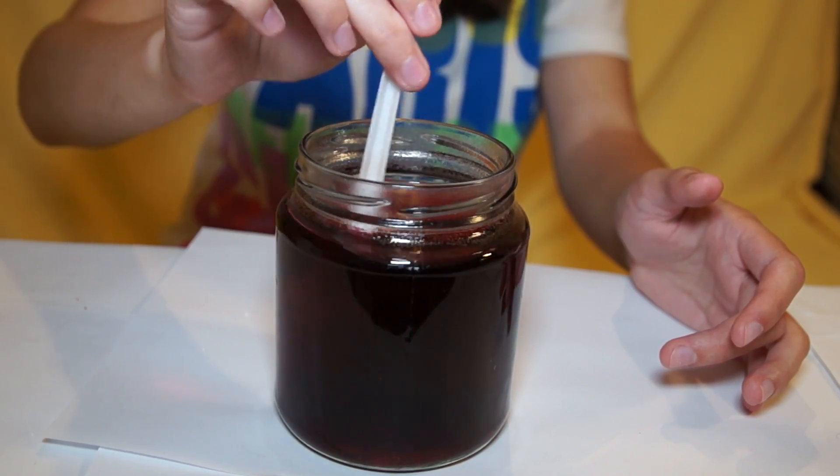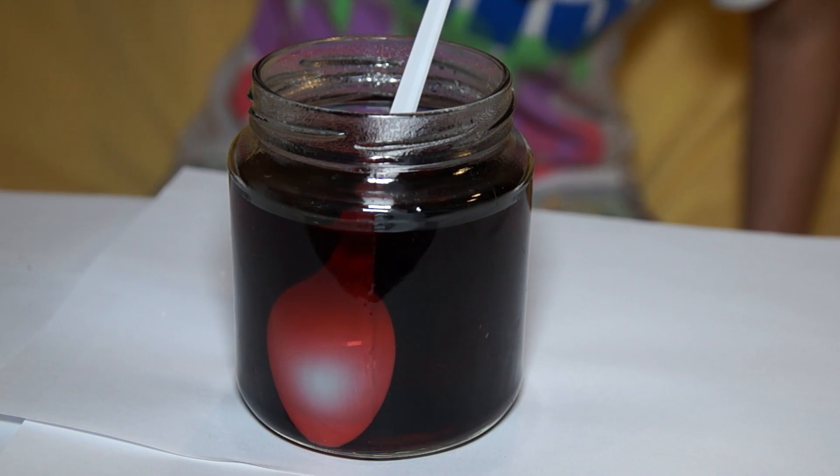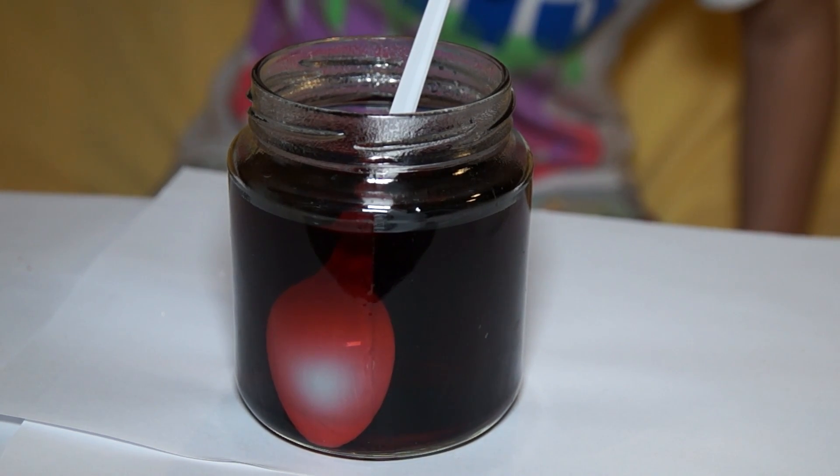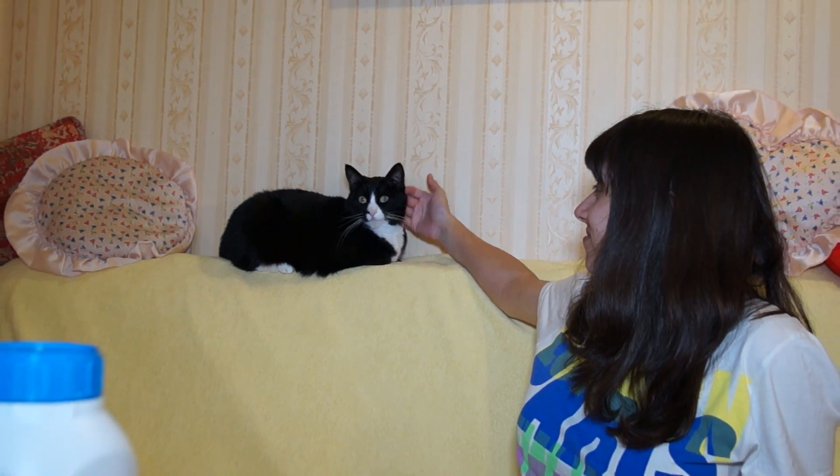Stir rapidly until all the salts have been dissolved. Now we will leave our beaker with the solution for a day so that crystals can be formed on the bottom of the glass.